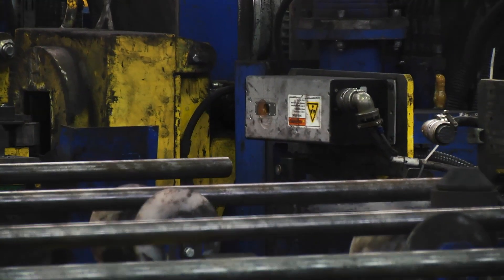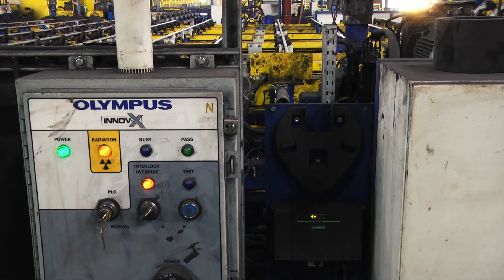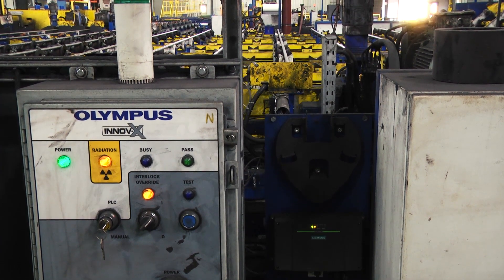The FOXIQ system is compact and has minimal power requirements, making it easy to integrate with new or existing PLC-controlled processes.